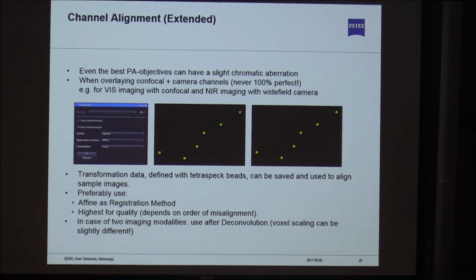This is less of interest for wide field images, for confocal images, or two-photon images, because there we are limited to the diffraction limit. But once you go to structured illumination, to PALM/dSTORM, or even to Airyscan, you can apply this shift. So it can be really helpful to improve your image quality, and especially of high importance when you do super resolution colocalization analysis.